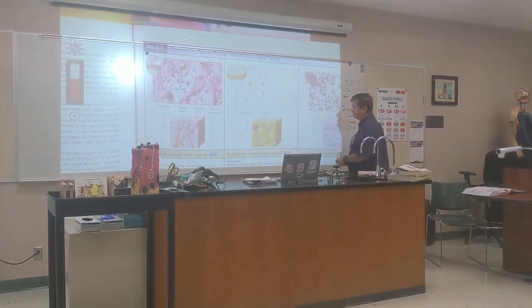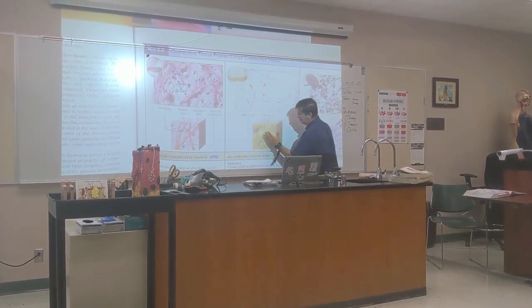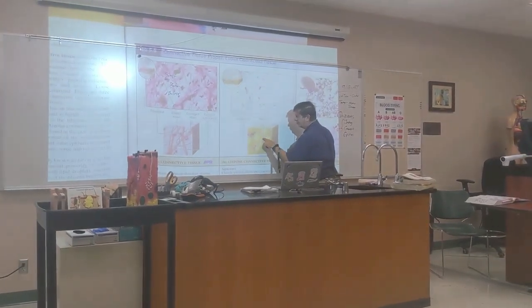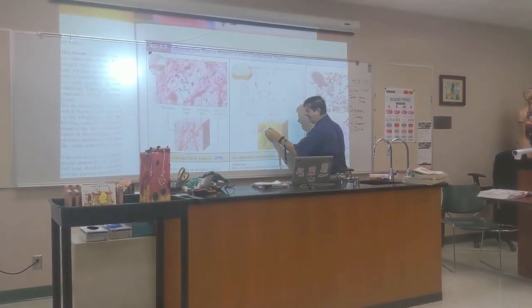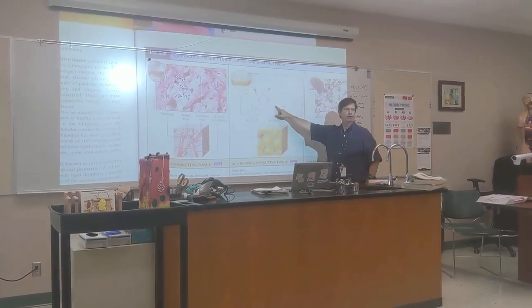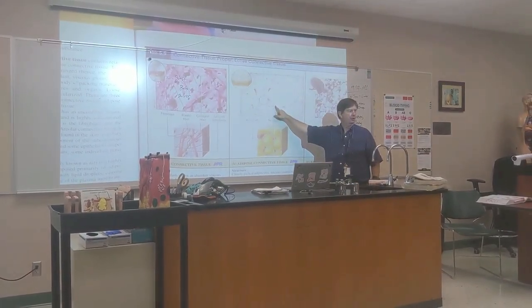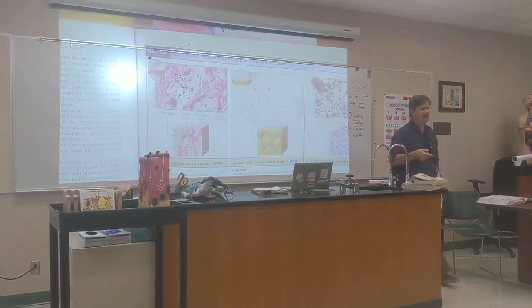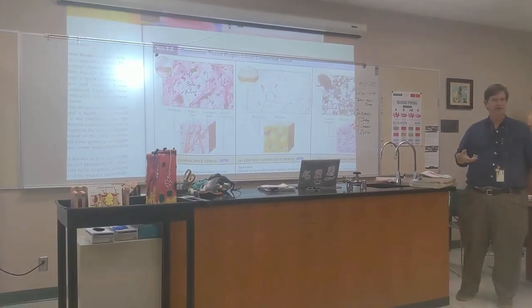Look at these specialized cells. All of the nucleus and cytoplasm is shoved off to the side. There's a big lipid storage vacuole here. That is lipid storage. The reason it looks white, do oil and water mix? No? Okay. Well, guess what? Most of the stains we use in anatomy are water-based.